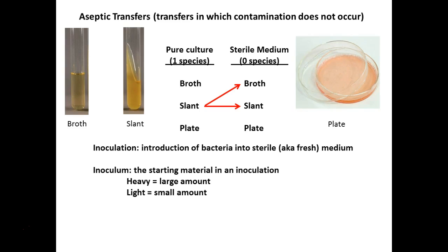You can really see this one up against the black. It's got crud all over it, from putting way too much bacteria on this loop. So you have the ash and the dead crusted-on bacteria on this loop. Not what you want to do.